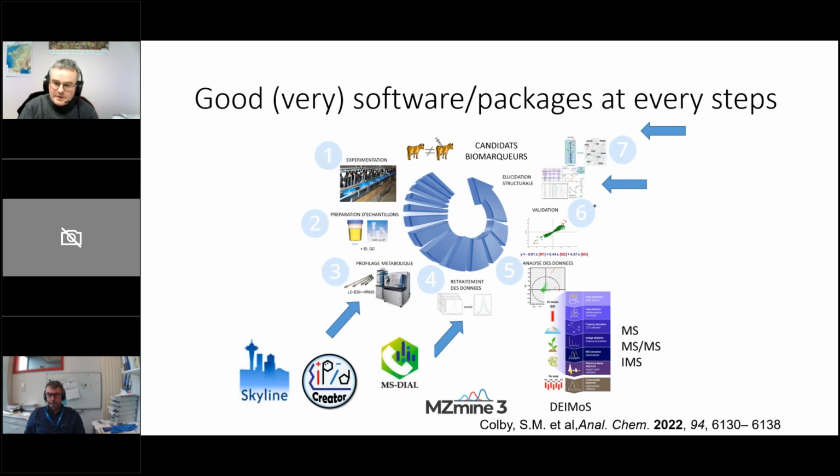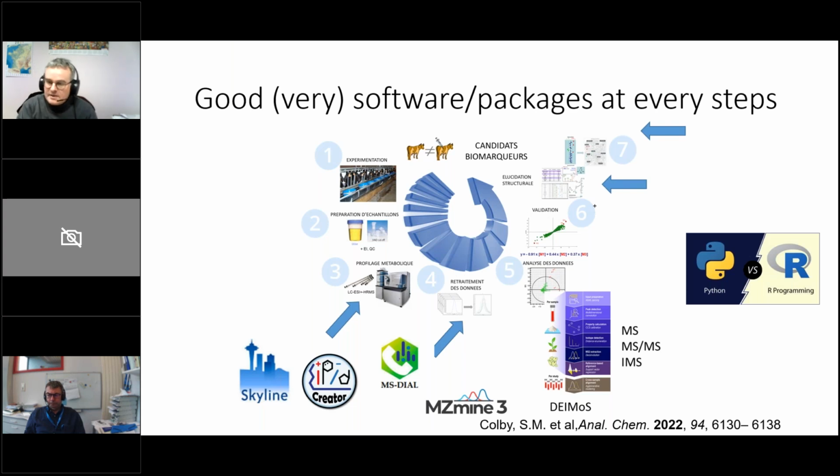So again, here we have a tool that is able to process ion mobility, and that MZmine can do also. And we have for sure all these Python and R scripts and modules available, but maybe not always that user-friendly.